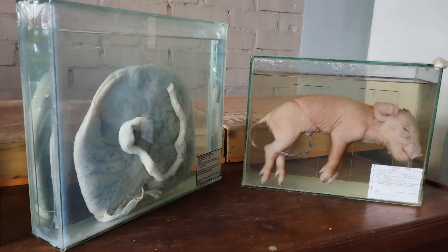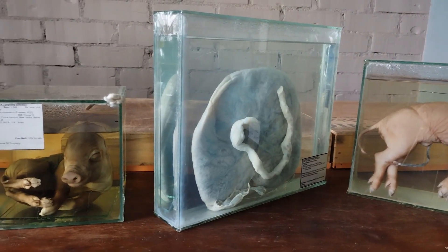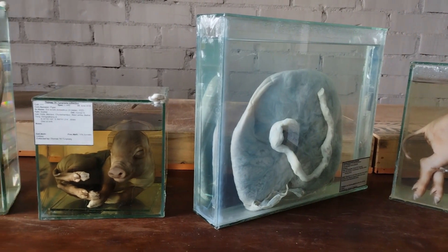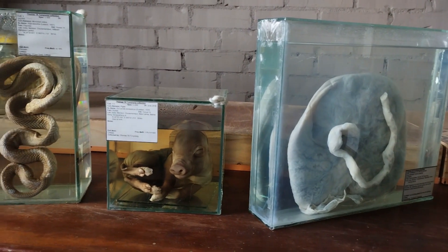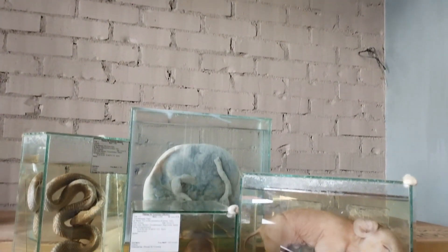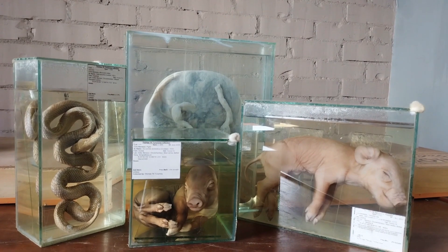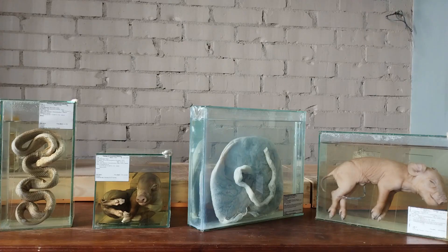I've personally had great success using fish tanks for storing formalin-preserved specimens, although I cannot vouch for their efficacy in storing alcohol-preserved specimens. I mostly, if not exclusively, work with formalin as a preservative, so it would be great to hear from people who have had some experience, hopefully positive, using fish tanks for alcohol-preserved specimens. Two advantages that clearly stand out are: one, anybody with a glass cutter, a tube of silicone glue, and some glass sheets can make a DIY fish tank.